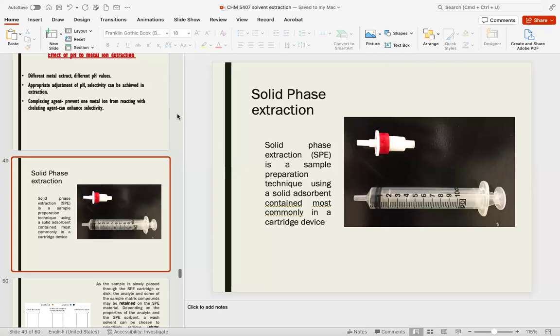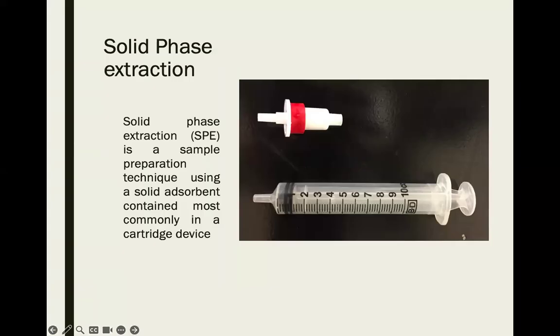So the second part will be solid phase extraction. What we discussed just now is liquid extraction. So the biggest difference is, of course, that one part of the extraction requires a solid adsorbent.